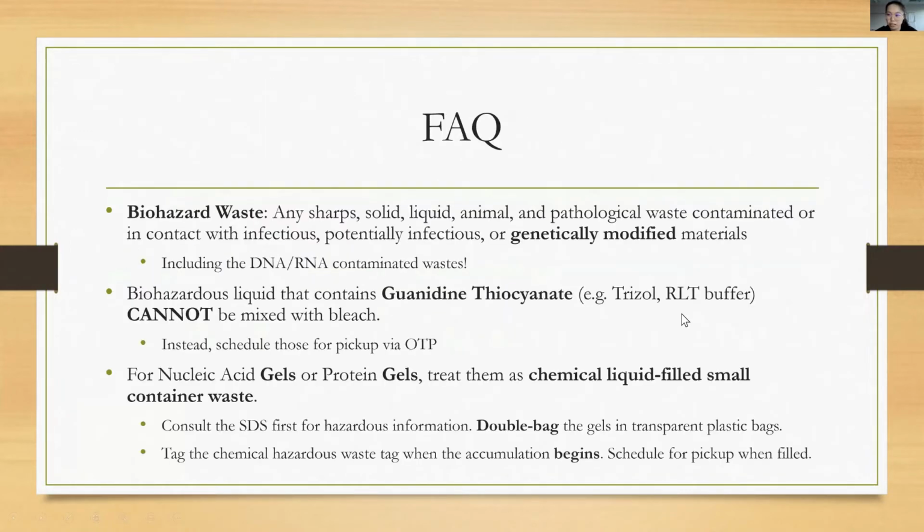But before I talk about any detailed disposal guidelines, I want to remind you of 3 of the most asked questions and most dismissed points in our lab practice. The first one is biohazard waste.